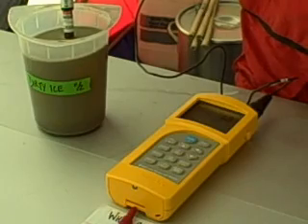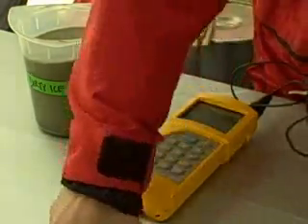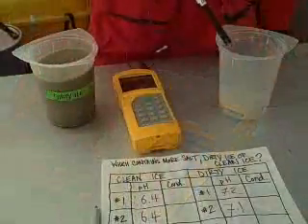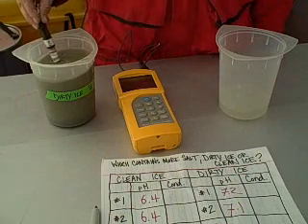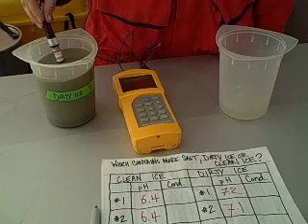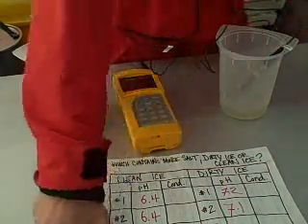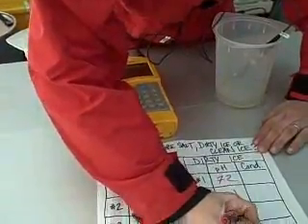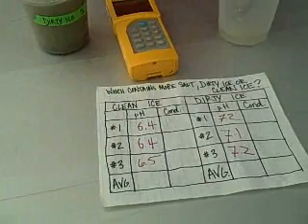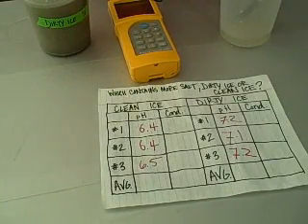It's climbing. And this one is probably about 7.1. And our last pH of the dirty ice, go with 7.2 on this one. So we have a 7.2, a 7.1, and then another 7.2. So you guys take the average.